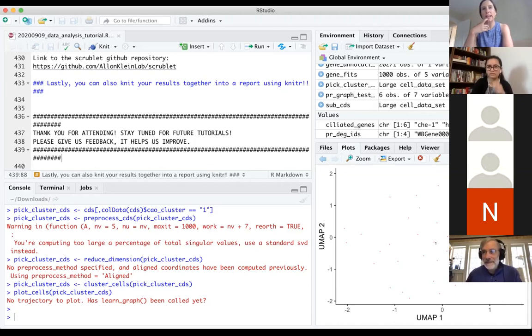And Brent, just to clarify, you could literally set the seed to any number that you want, right? Like you'd always just say set seed equals 1, or set seed equals 1, 2, 3, 4. Yes, it can be any positive integer. 0, I believe, will not work, and negative numbers won't work.